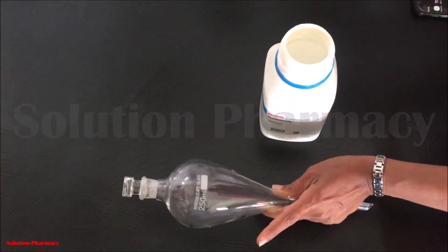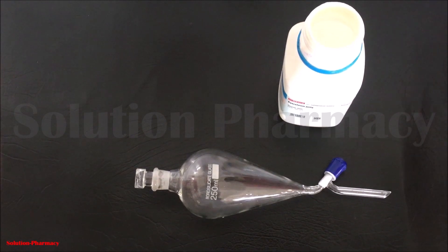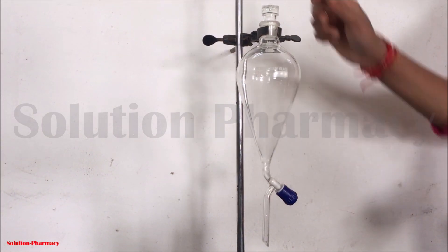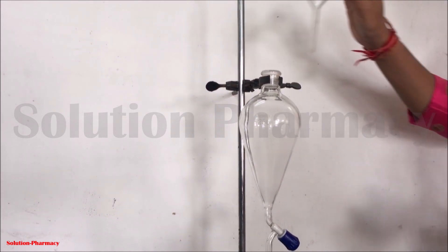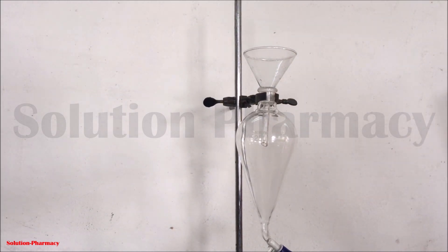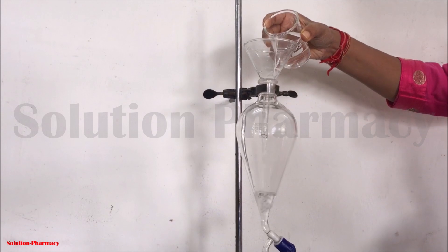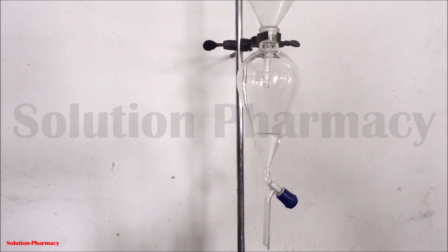Now the separating funnel is properly sealed — the stopper is tightly fit to the joint. Using a clamp and stand, fit the separating funnel in the upright position, then close the stopcock tightly. Remove the glass stopper and transfer 20 to 25 ml of water into the separating funnel. We are doing this step just to check if there is any leakage from the stopcock. Here you can see there is no leakage from the stopcock side.